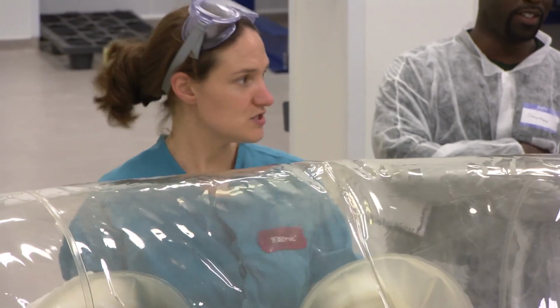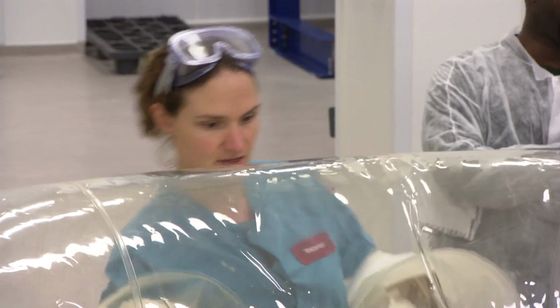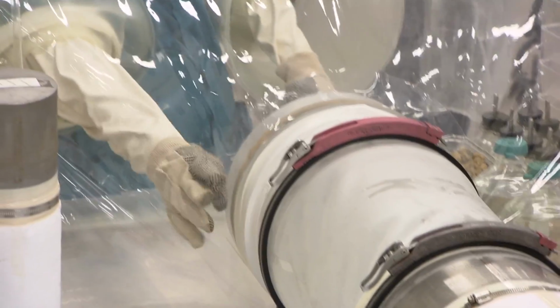All right, so once your sterilant contact time has elapsed, and you see that you still have a nice bubble here, so we know we don't have any holes, you can go ahead and open your port.